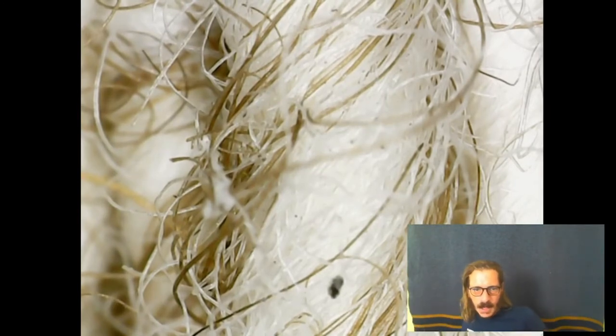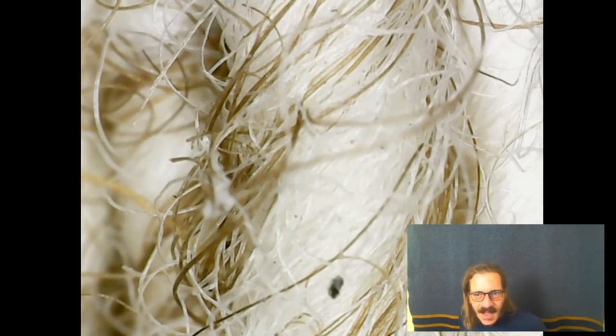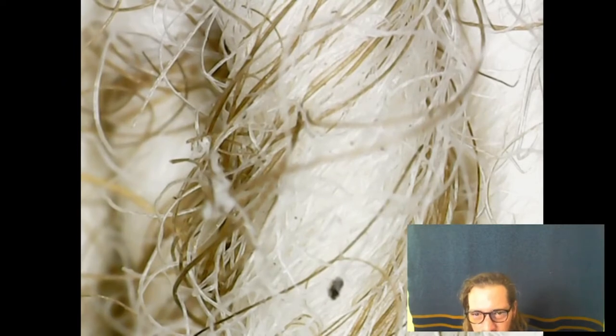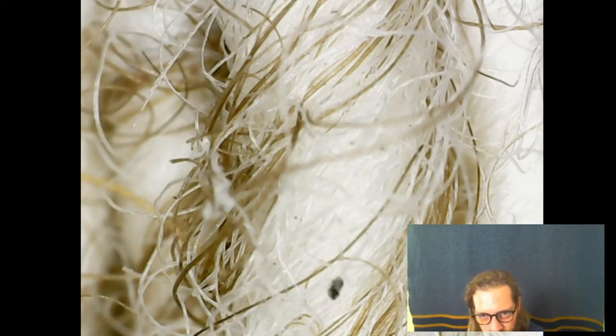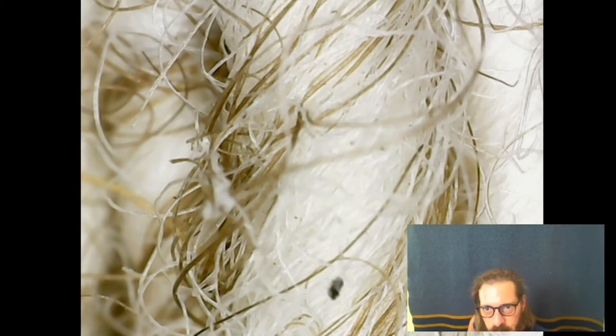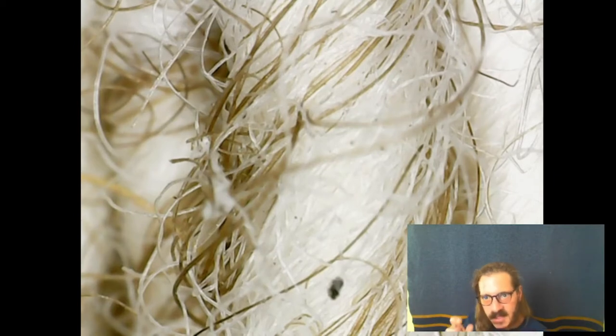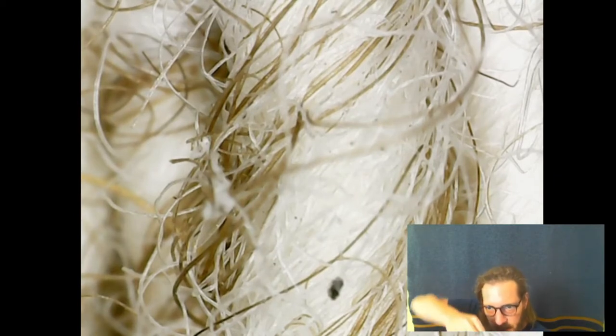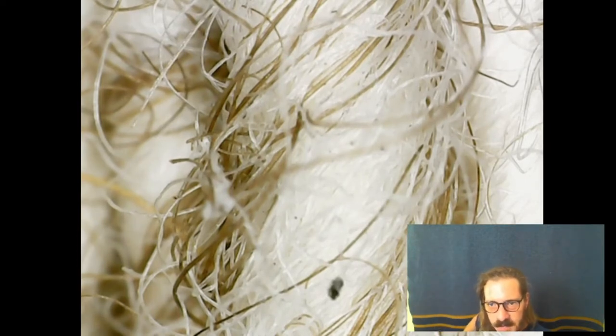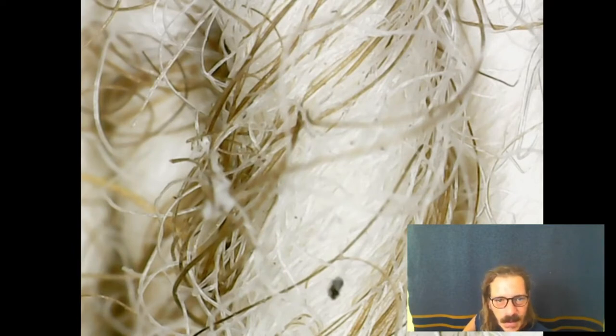Here we've been looking at some wool and alpaca mix. I spun some white wool to contrast with this brown alpaca. You can see all those little flecks of garbage and stuff in there, all of the different sizes of the fibers. The brown alpaca is just a little bit larger in diameter than this wool. You can see the individual sections of the wool fibers, as opposed to this long, glassy, almost like fiberglass sections of the alpaca. I just love looking at stuff on this angle. This is what we were looking at - just a little sample of poorly spun alpaca and wool mix.